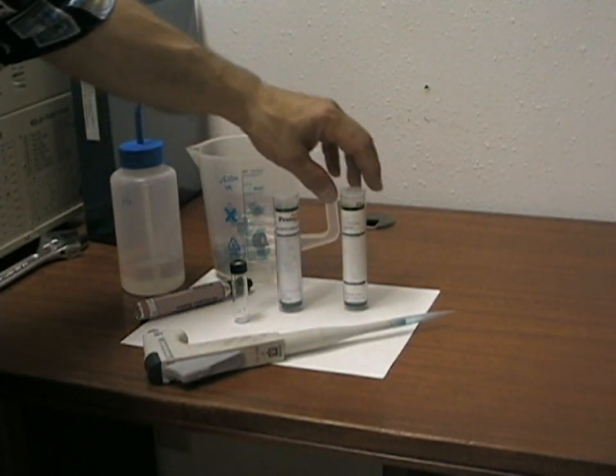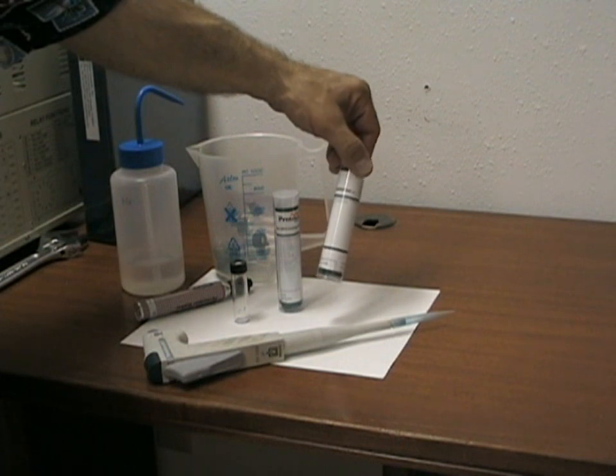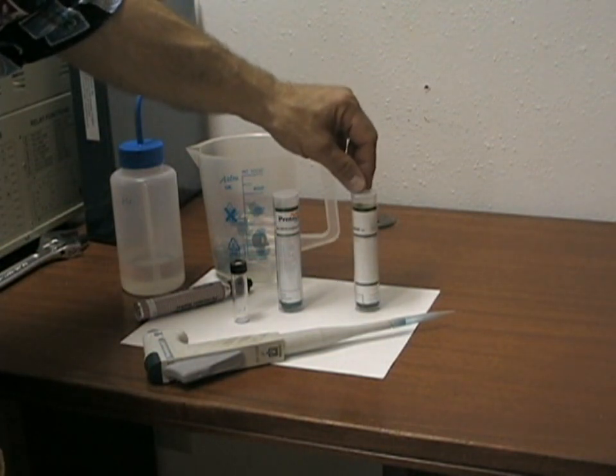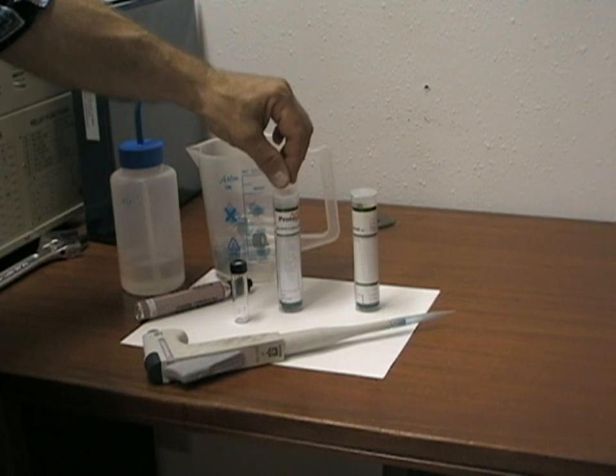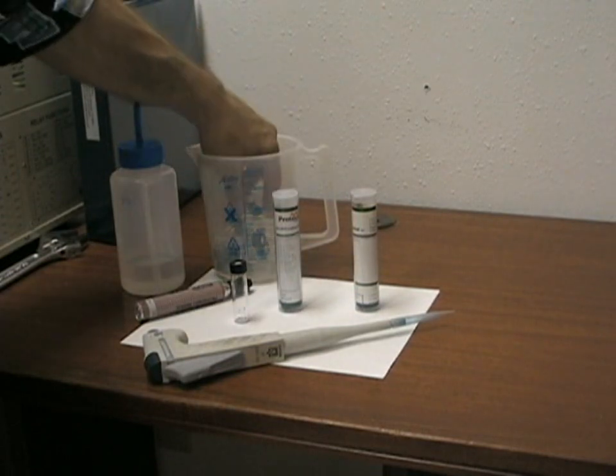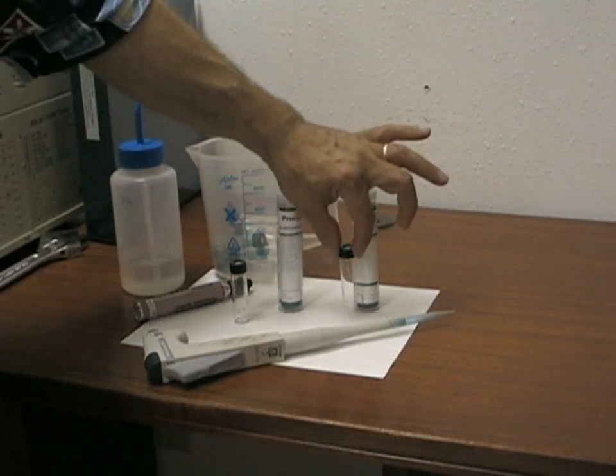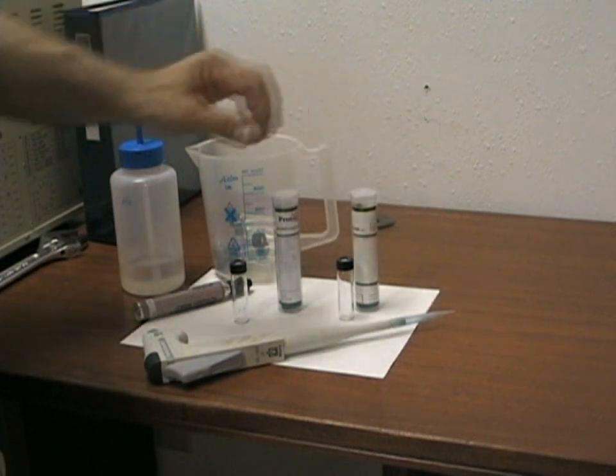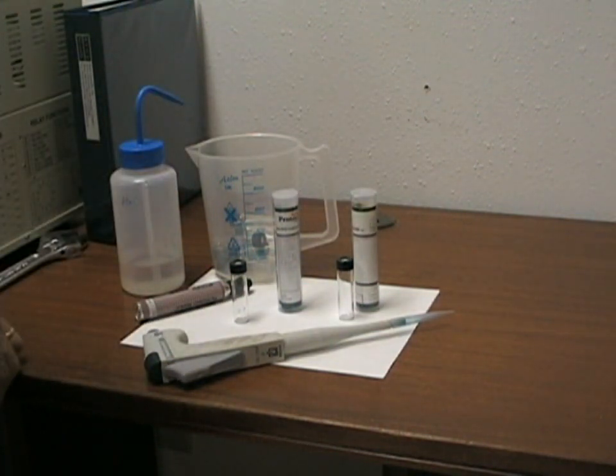Please note that the acetaldehyde is run as a separate standard because it is not stable when mixed with all of the other materials. So we will prepare a 100 part per million acetaldehyde separately and run that by itself to make our complete calibration table.